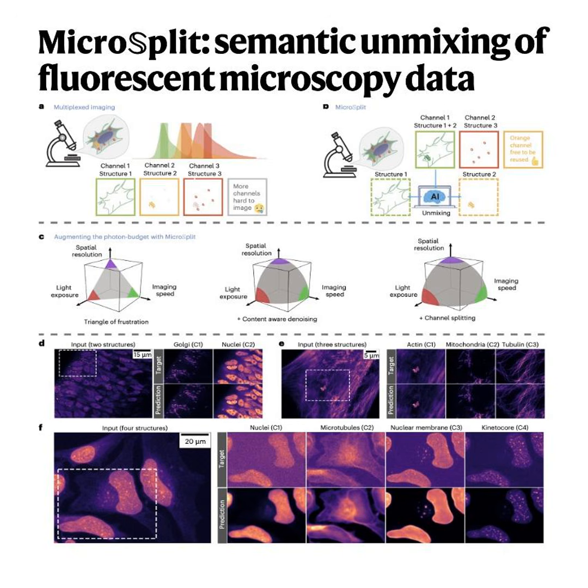Which brings up an interesting question to think about. Yeah. Have you ever tried to stretch a really limited resource too far in your own work? Keep that specific feeling of frustration in mind as we introduce the AI solution. Because that solution is MicroSplit. Yes. Enter MicroSplit. This deep learning-based computational multiplexing method is just wild.